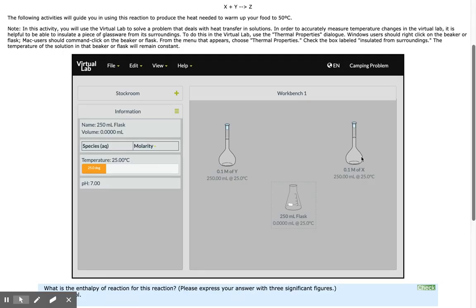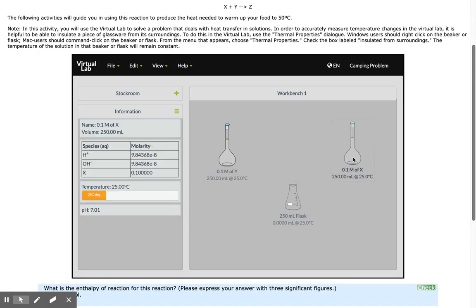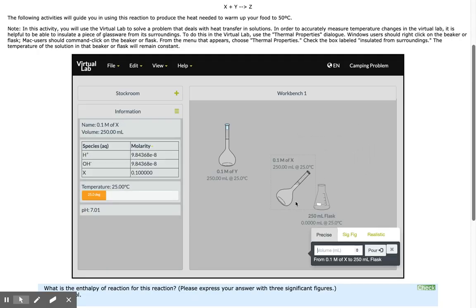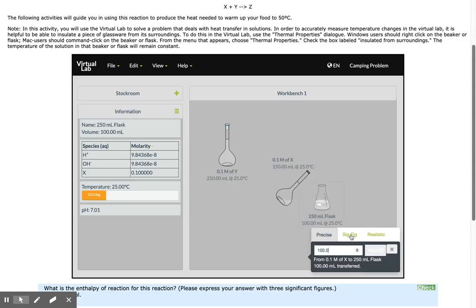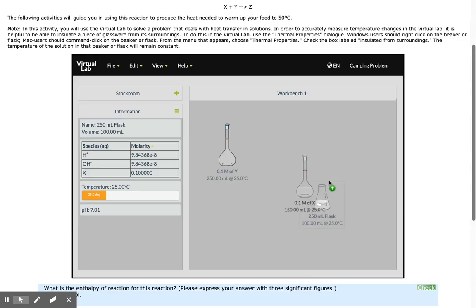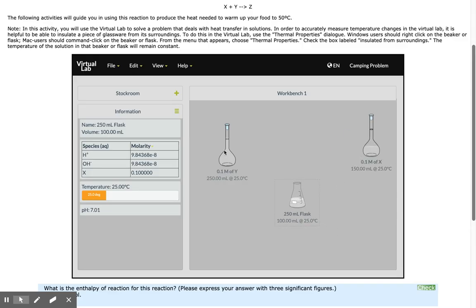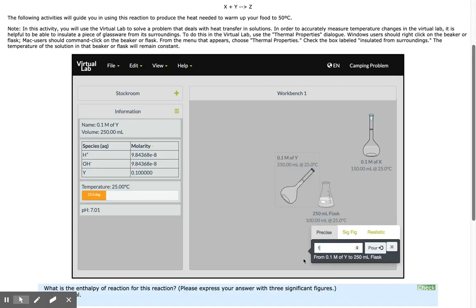I'm now going to start the chemical reaction. I'll add 100 milliliters of X, then 100 milliliters of Y.